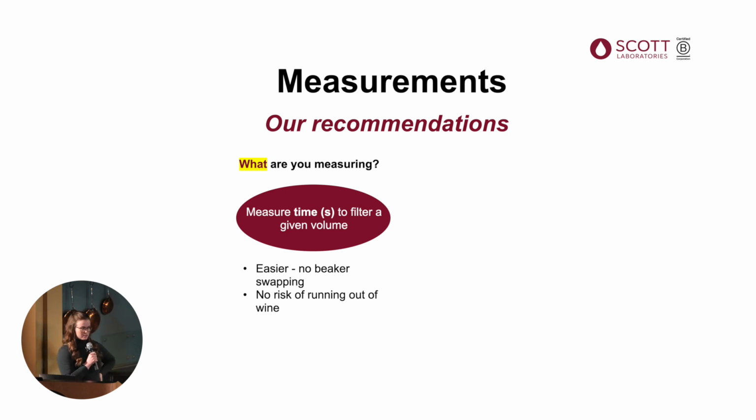And frankly, a lot of this is just logistical. It's easier to conduct the test this way. You don't have to swap beakers. For example, when the scale reads a certain amount, you can just note the time that occurred. Versus if you're measuring volume, you'd have to pull the beaker and switch it at that time period so that you can then set it down, let it settle, and record the volume. So logistically, it's a little bit easier to conduct the test if you're measuring time rather than volume.